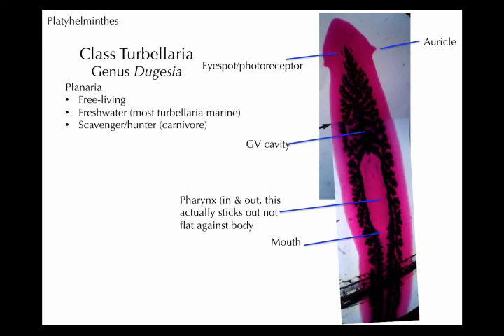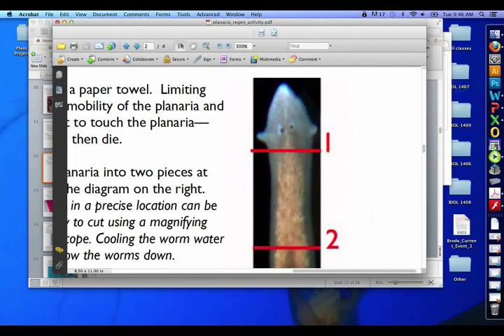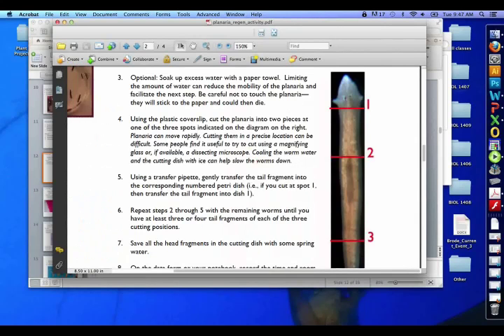Their other type of sensory organ is going to be these little spots — these are actually the photoreceptors, the black parts you see. The eye spots are the white and the black tissue, and the photoreceptor itself is the black tissue, and that is light sensitive. It doesn't see a picture like our eyes do, but it can detect when there is light and when there's not. Basically, when Planaria detect light, they tend to swim away from it — because it's probably less likely to get eaten if it's not bright out.